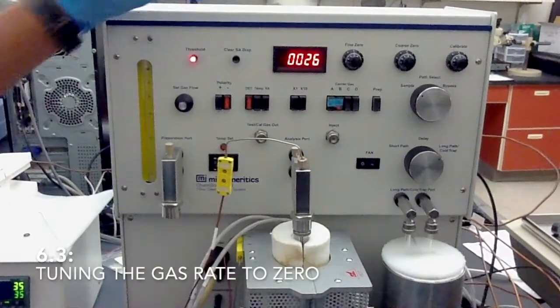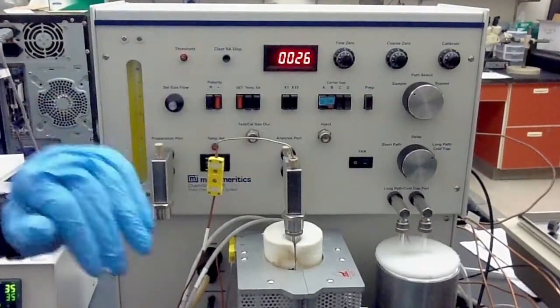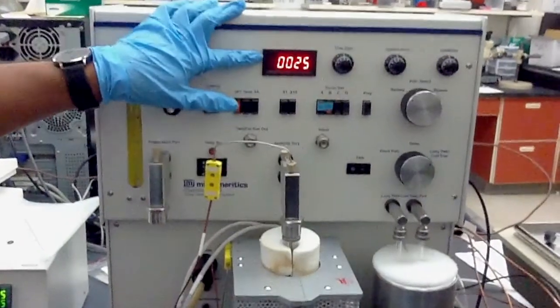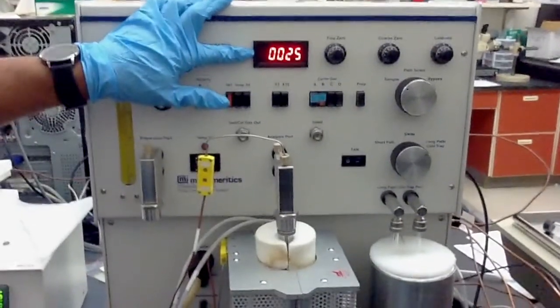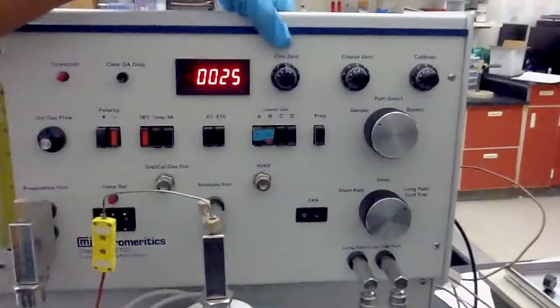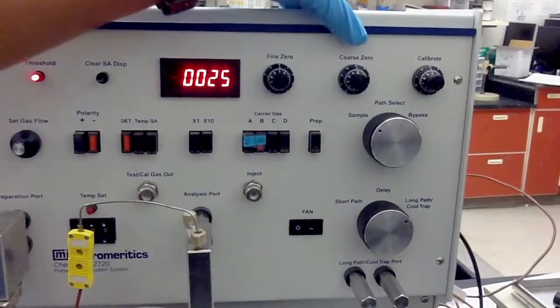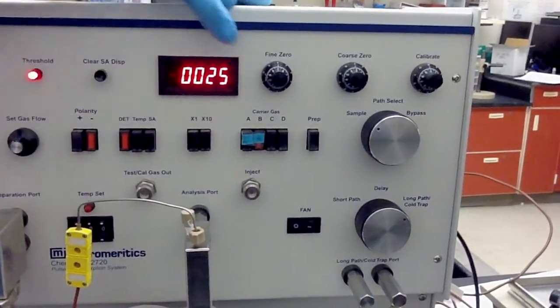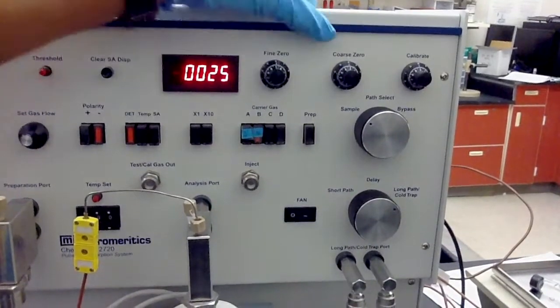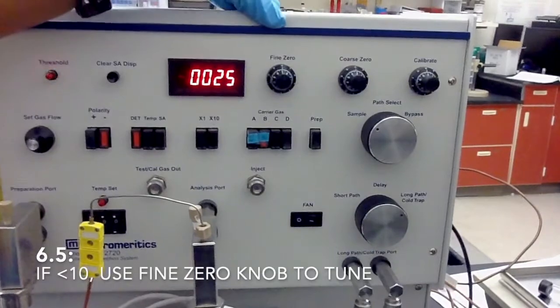So once this reading comes back to a stable reading, which is like 26 or something, in this gas flow rate, we have to make this one zero. There are two knobs, two valves. We have to tune them to make this one zero. One is called coarse zero, another is fine zero. If this one is more than 10, we have to use coarse to bring it around 10, and when it's less than 10, we have to use fine zero.